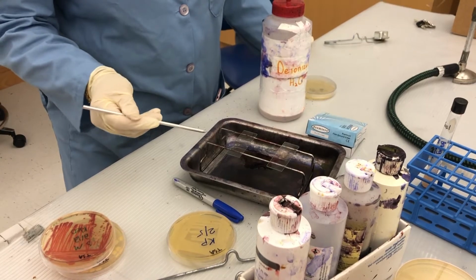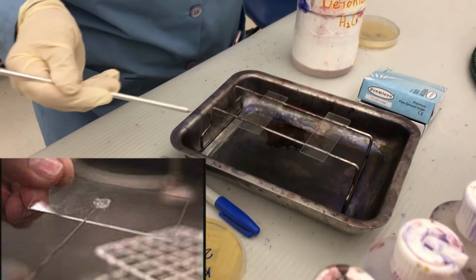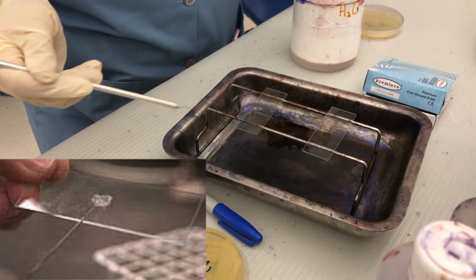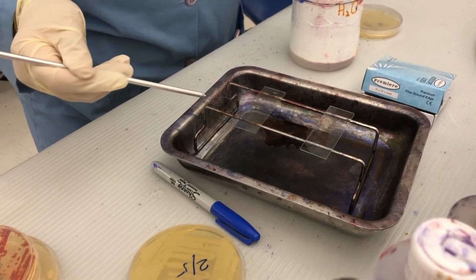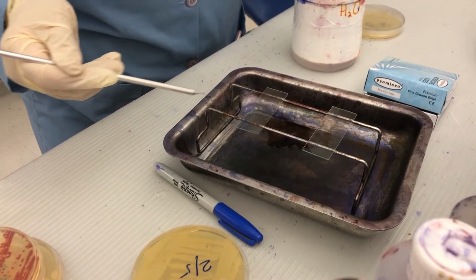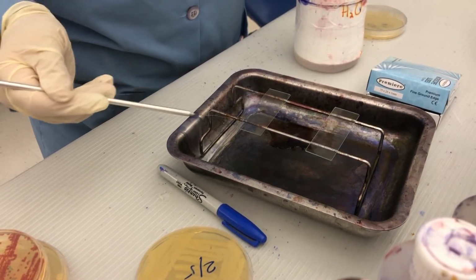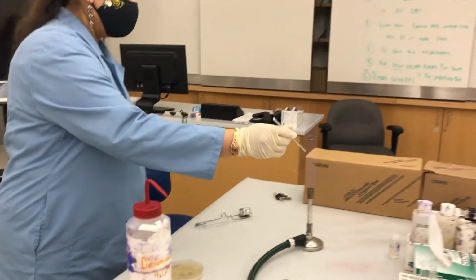And as you are spreading the water, you can see that it is kind of cloudy, which is good because that would really make sure that you have your cells in the liquid, in the water. You want cells, right? If it is not cloudy, you will be a little confused whether you have enough cells or not. I can see that the liquid is cloudy, so I'm pretty sure the cells are right there. And now I'm going to sterilize the loop.